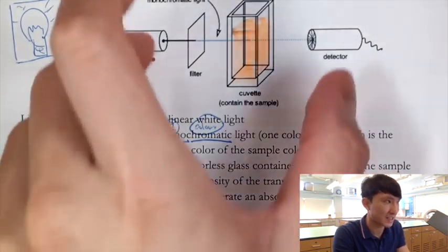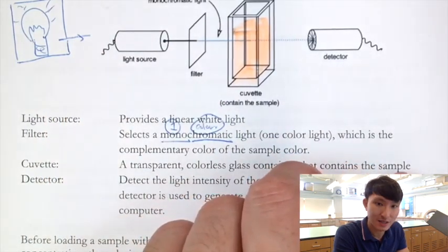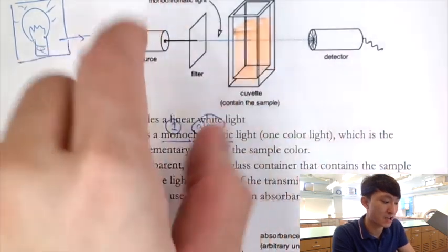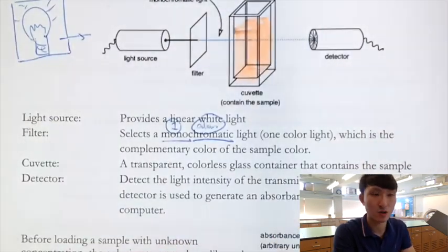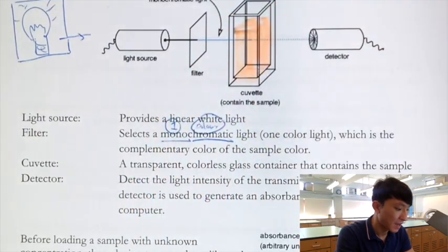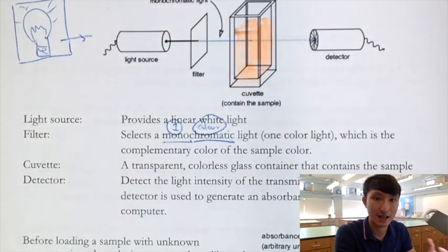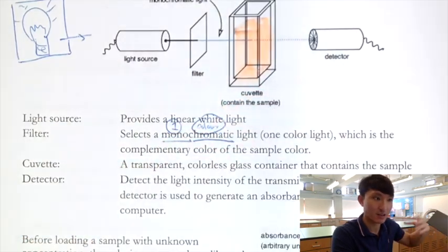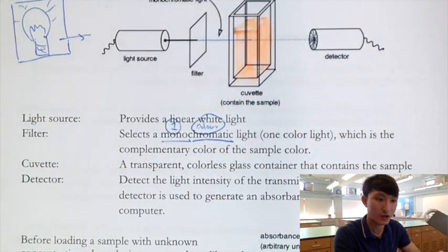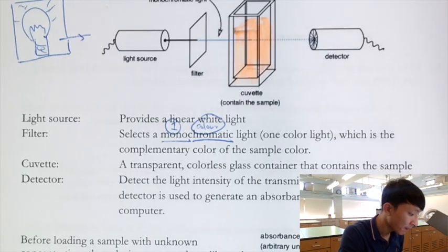So imagine it has another setup right here where it has an empty cuvette. So they measure the amount of light reaching the detector, and then also measure the amount of light reached at this detector, and the difference between the two setups will be telling you about the absorbance. Even though you do not have two setups, at least you can put an empty cuvette inside for calibration. So you take a blank record or blank data, and then you carry out the analysis, and the computer itself is allowing you, or you can do it manually, to find out the actual absorbance. So that's the idea.